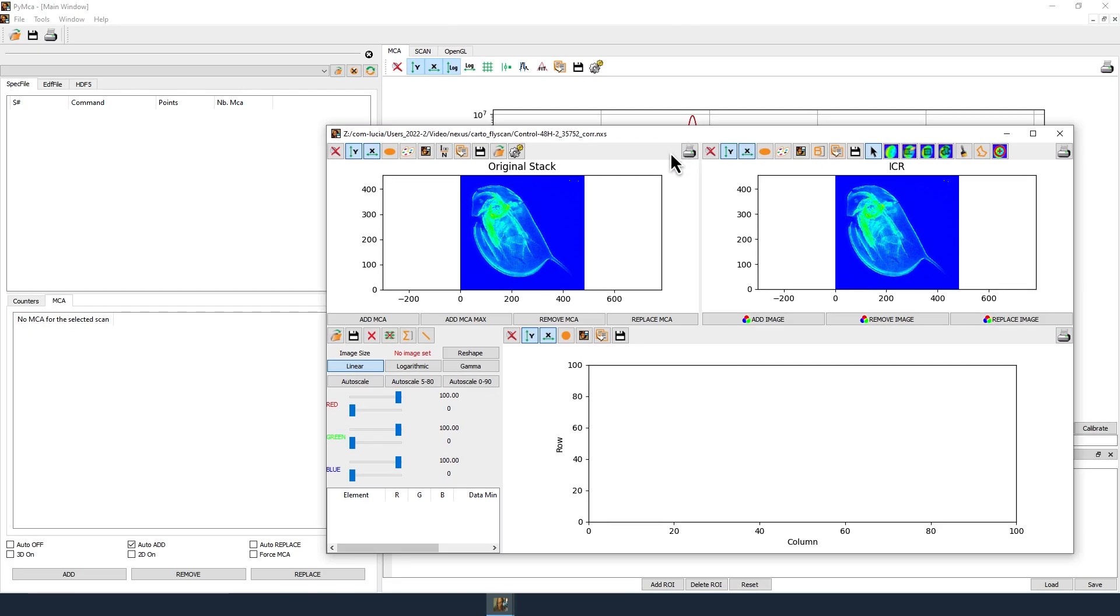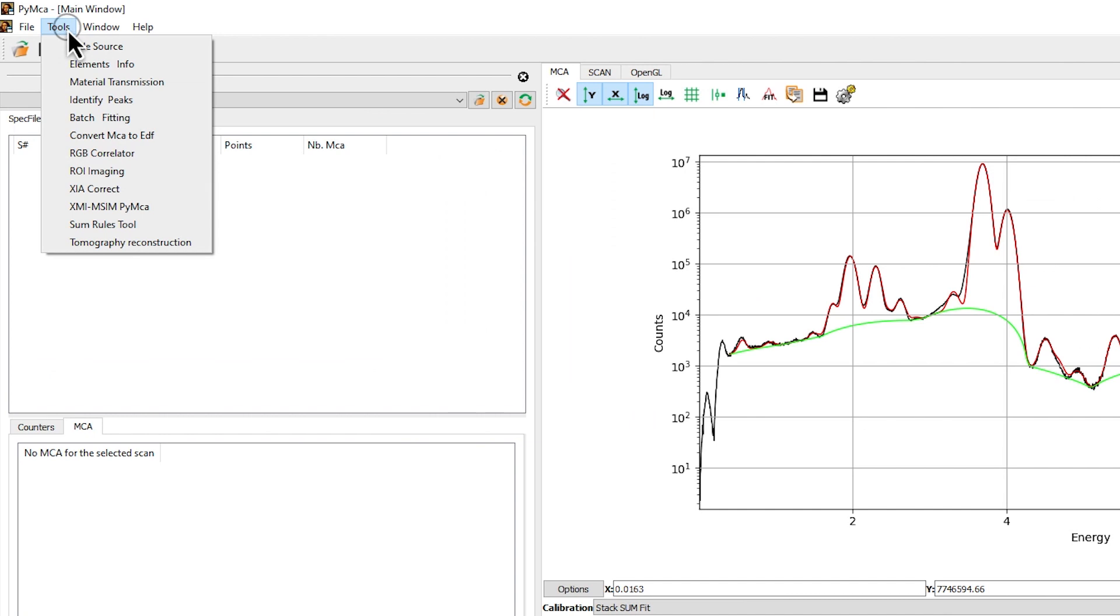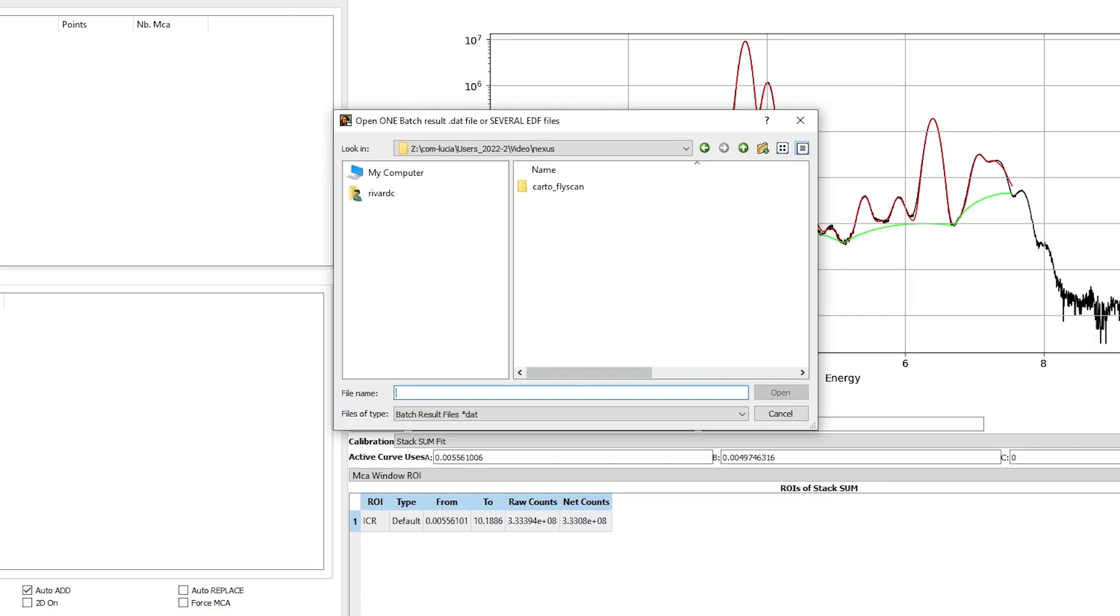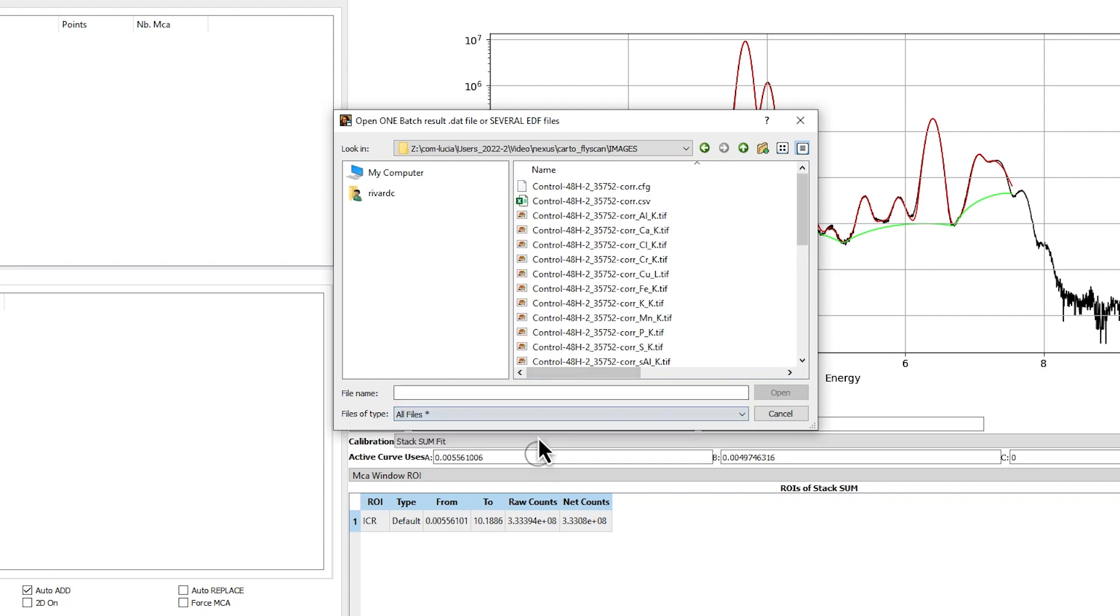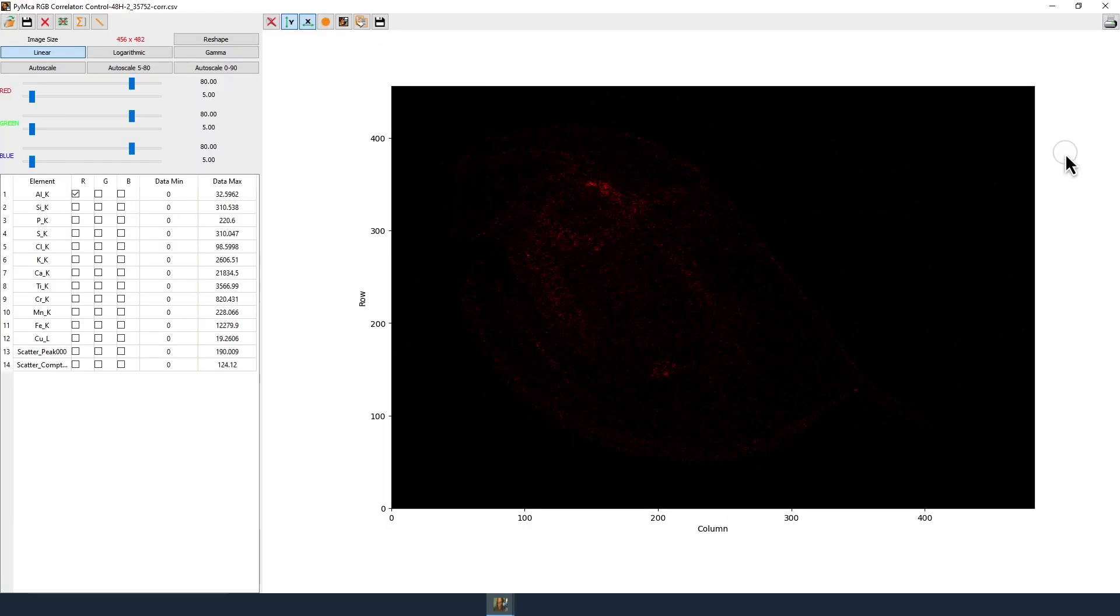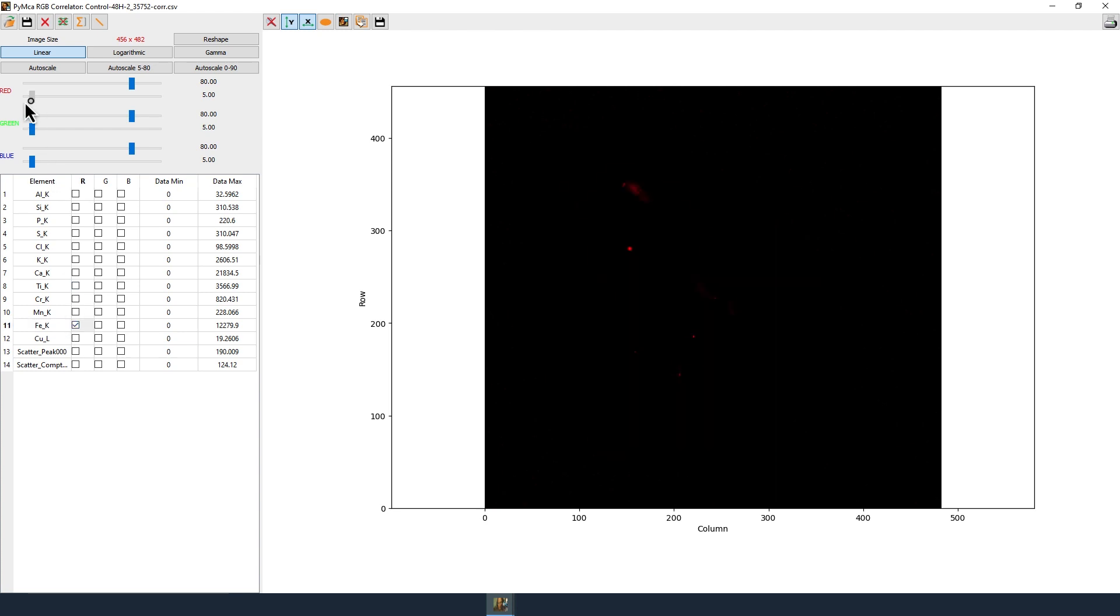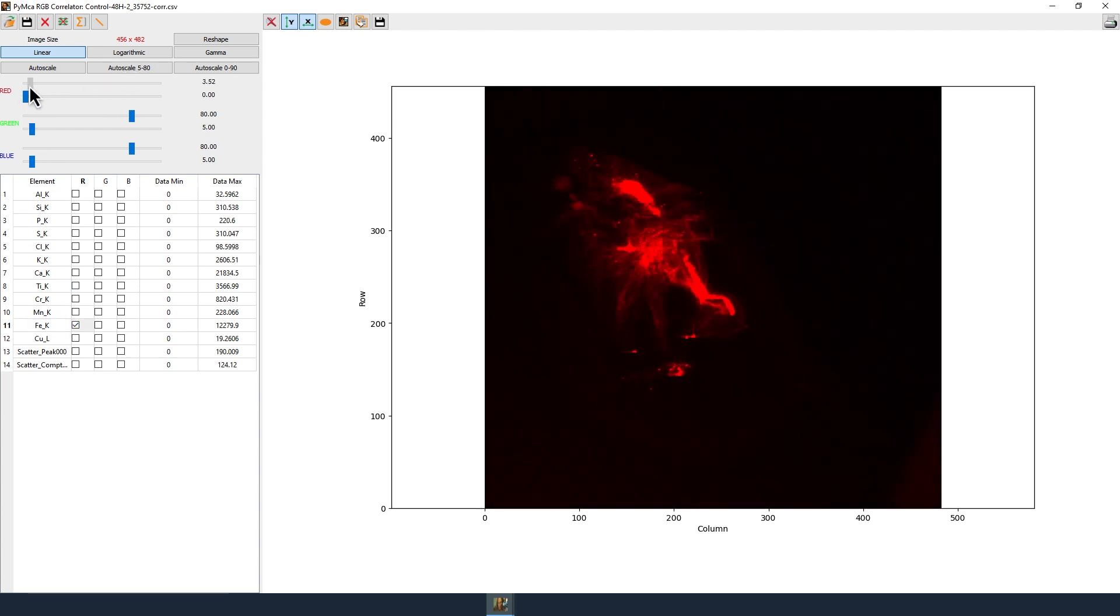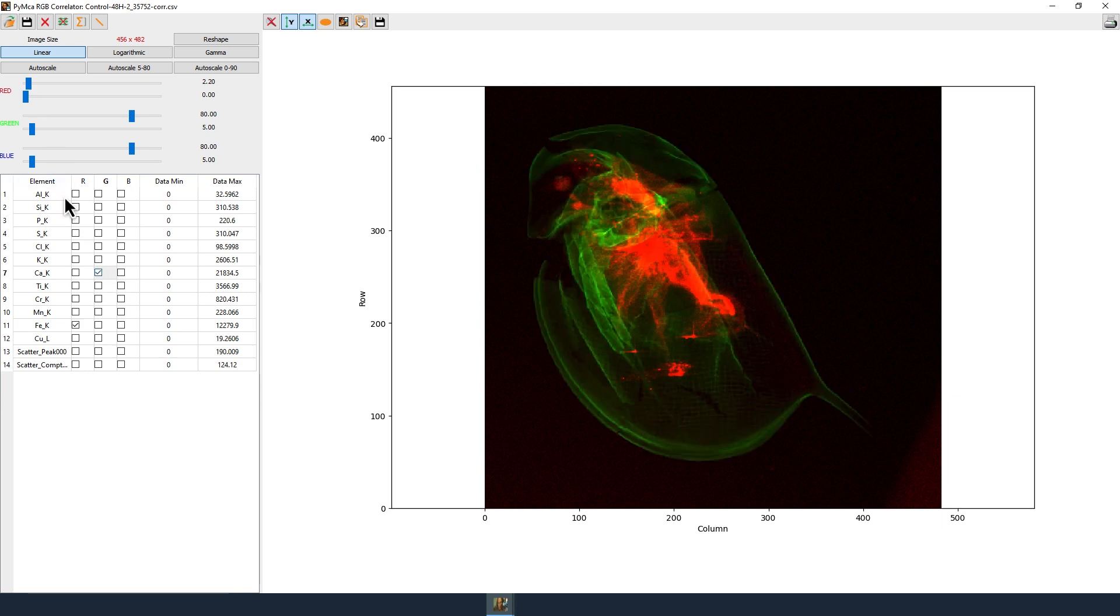In the main window, click on Tools then RGB Correlator. Browse directories to find the images directory. Select all files in the type of files tab and select the star.csv file. You can display your map using the red, green, blue color code, adjusting each color scale.